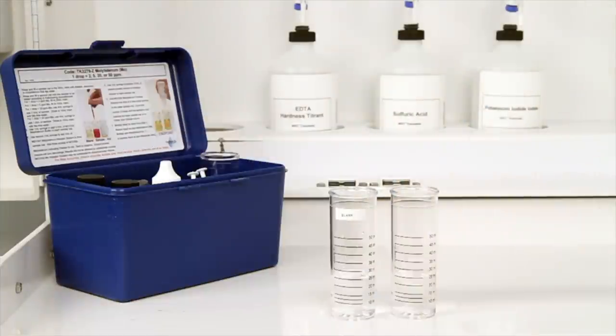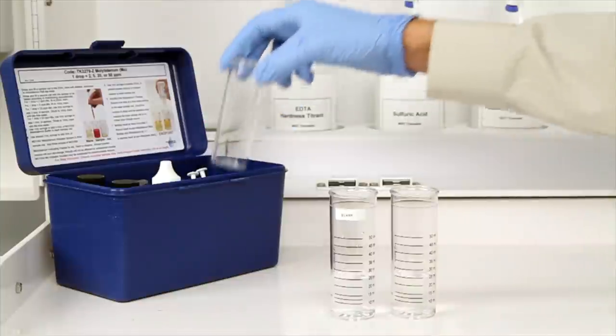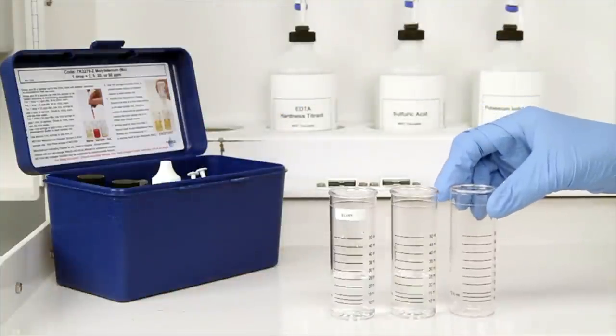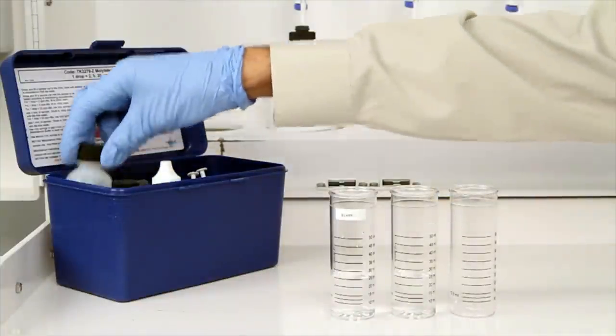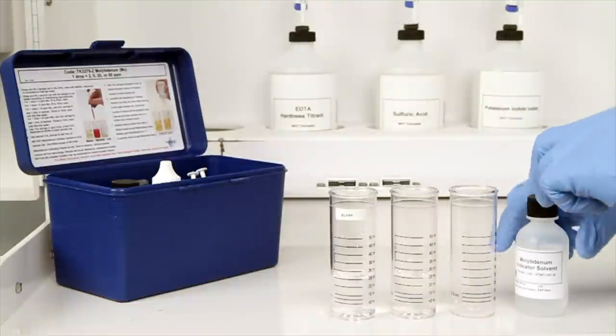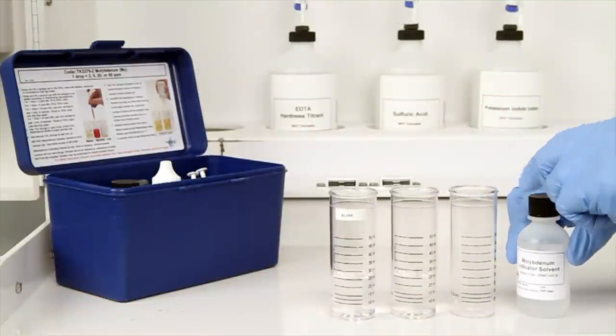The next step according to the endpoint ID procedure is to add two milliliters of molybdenum indicator solvent to a third vial. Use another one milliliter syringe included in your kit for this step.